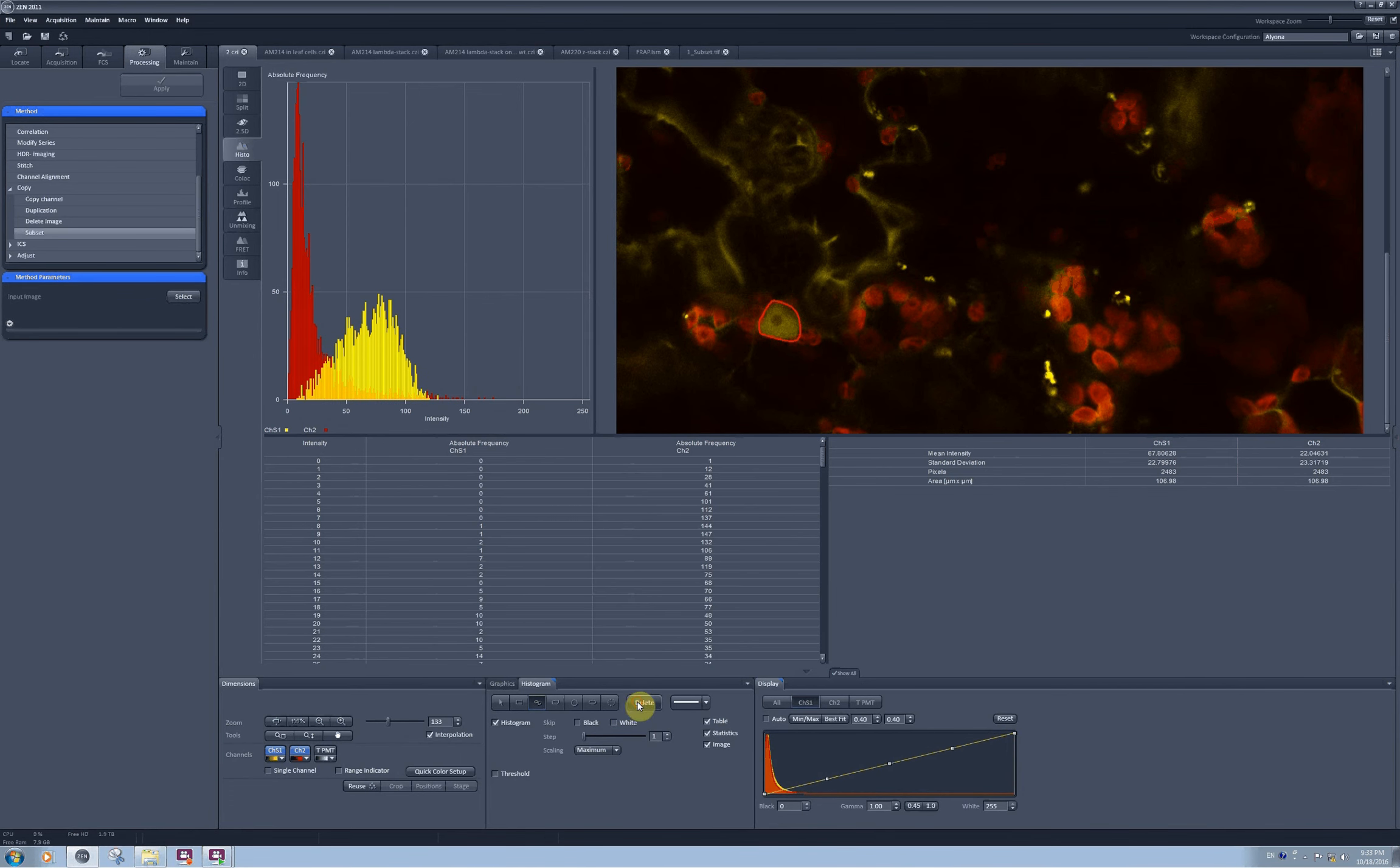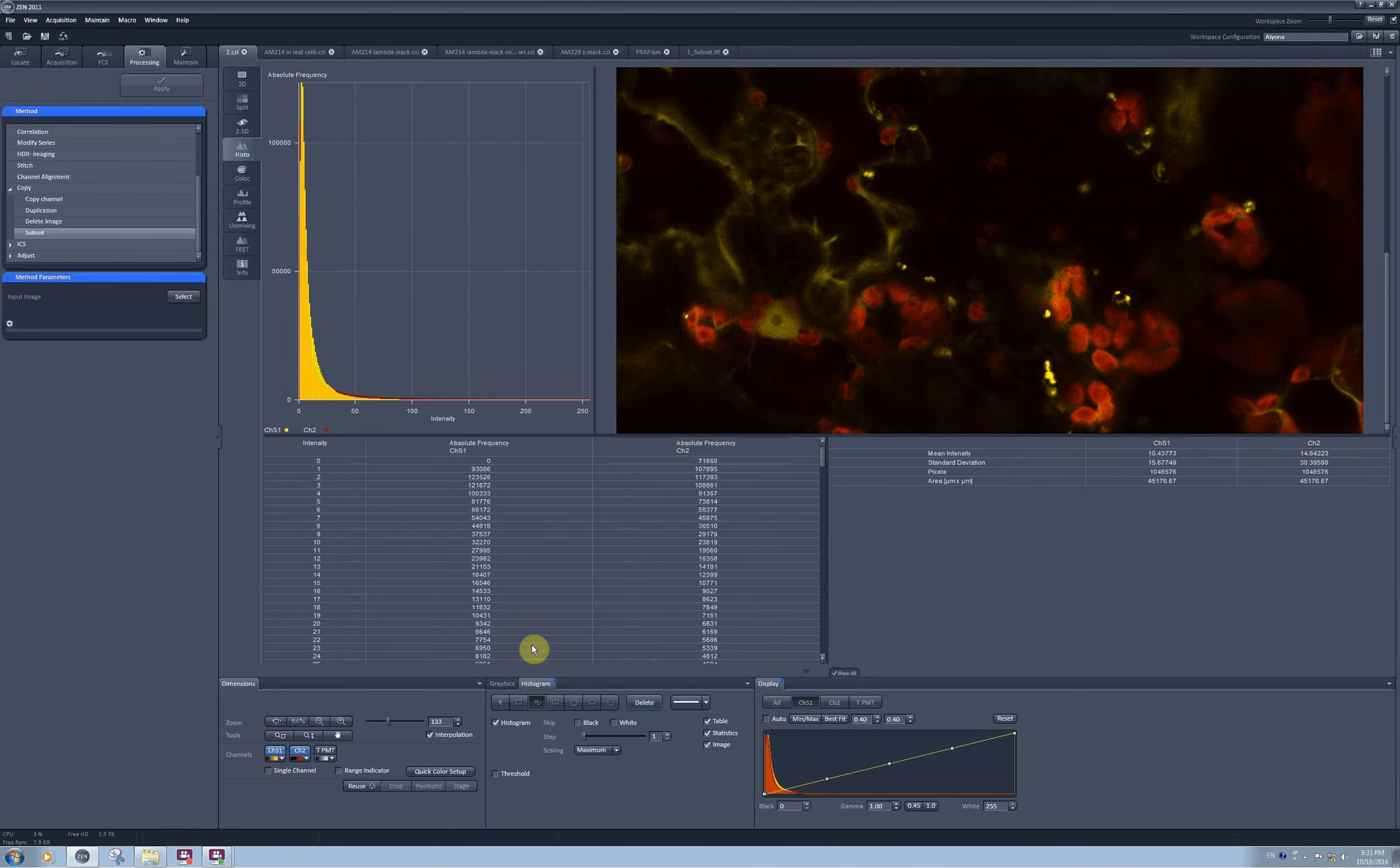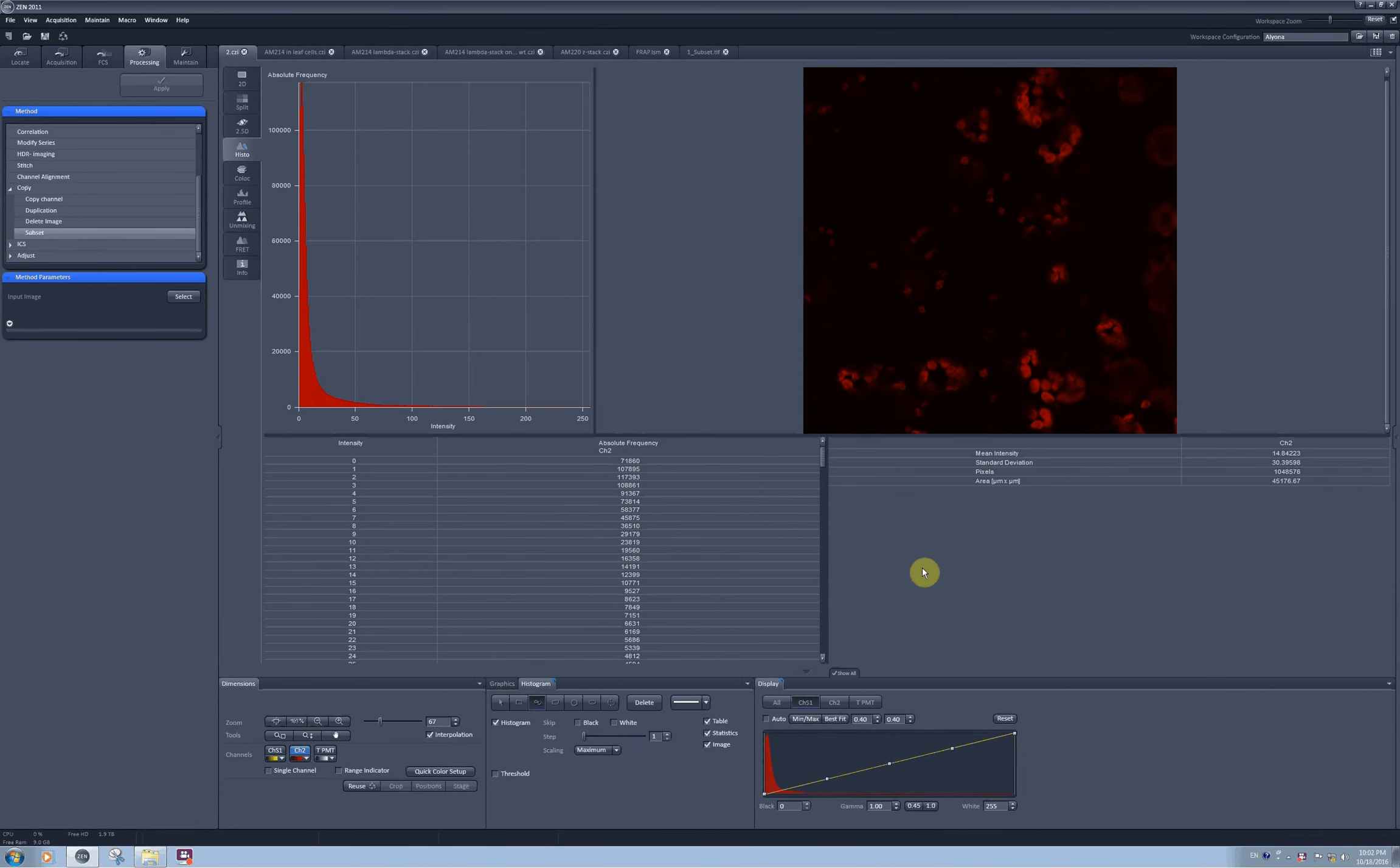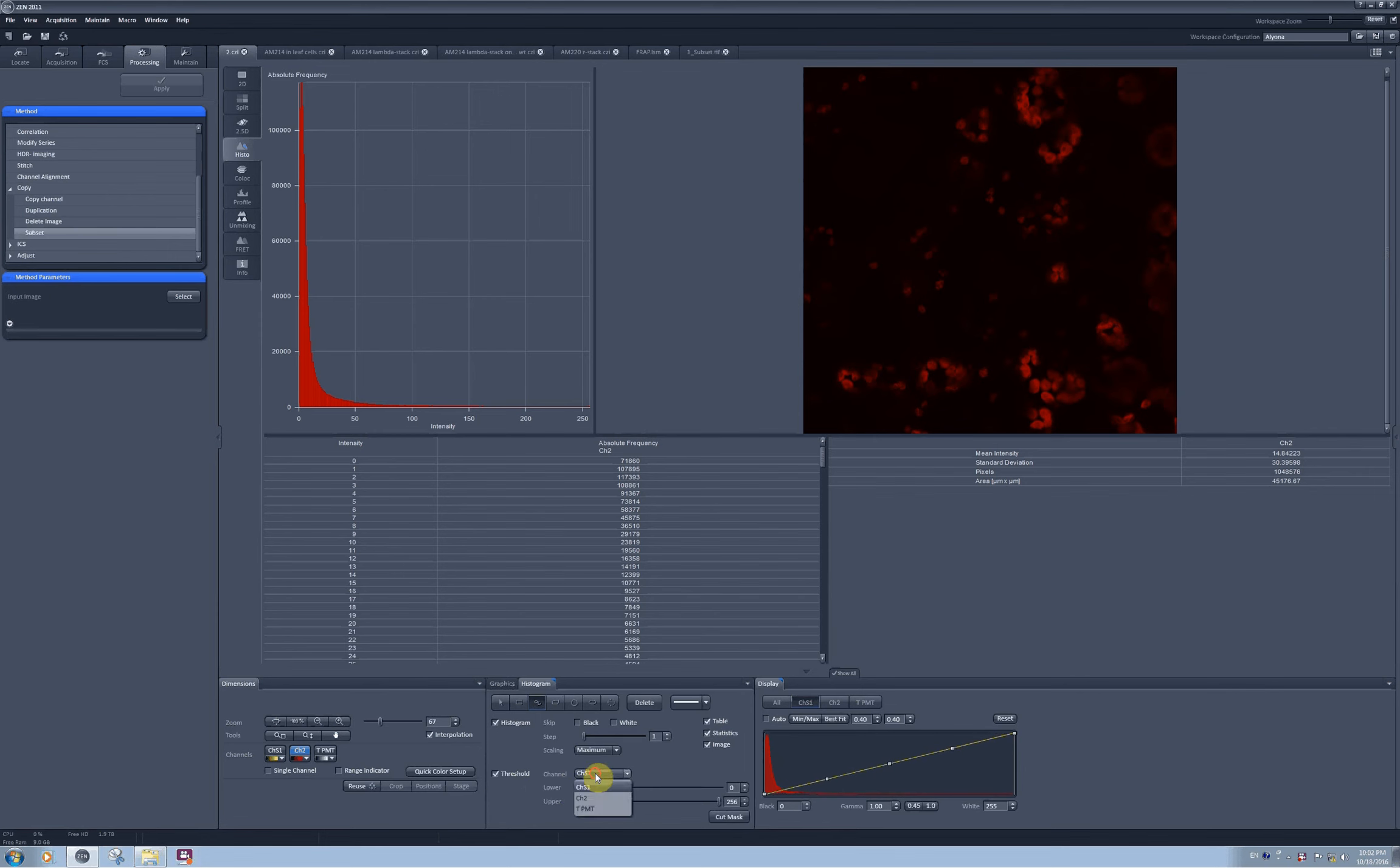This manual selection can be quite laborious. You can help to speed it up by using a threshold function right here. You need to activate it by clicking on checkbox and you will get this menu available where you can select which channel you want to threshold and then what threshold you want to set.